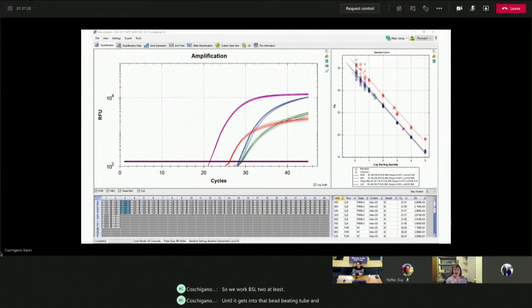And actually even before that, when we're precipitating it, it's been shown that the liquid I'm adding to precipitate the virus actually inactivates it. And also the solution I'm adding to release the RNA also inactivates it. So all along the way, I'm doing things that are going to inactivate that virus. So the PPE that we're using is more a precaution than a real necessity.